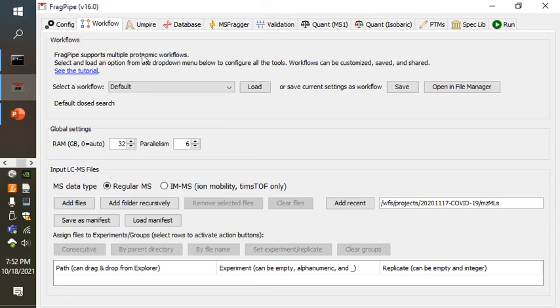I am recording this video today to explain how we could create a sequence database from a bottom-up proteomics data set that includes just the proteins that have evidence from that bottom-up proteome in order to give us a relatively small number of proteins to search in top-down proteomics. So this is a case where our sample's been analyzed first by bottom-up proteomics and secondly in intact form to produce the proteoform data that we would need for identification.